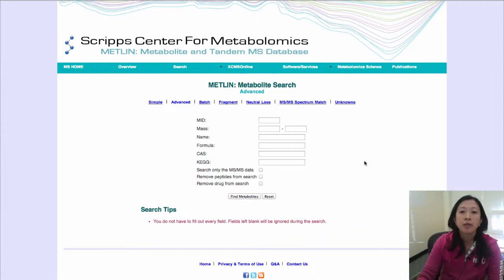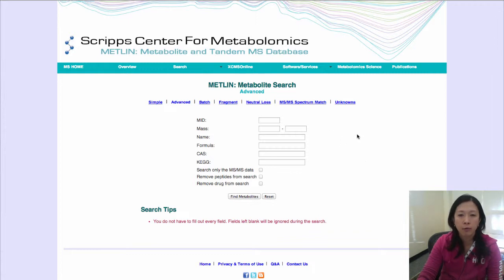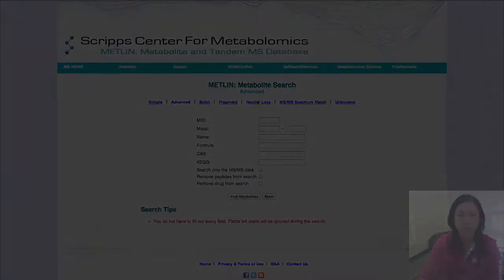Also, if you have MS-MS data of an unknown and you would like to search for an unknown, you can either use fragment, neutral loss, or MS-MS spectrum match.